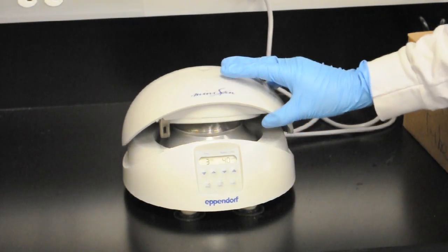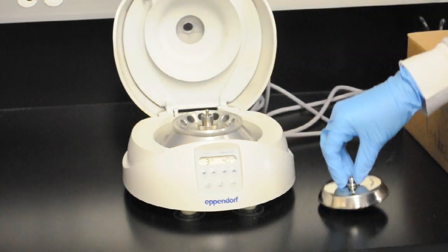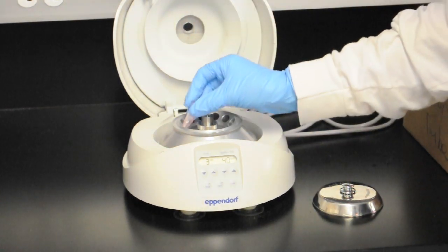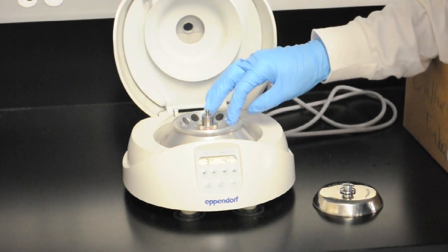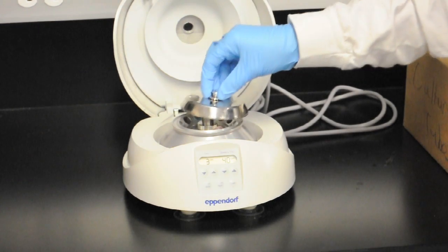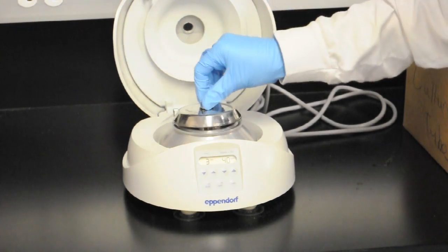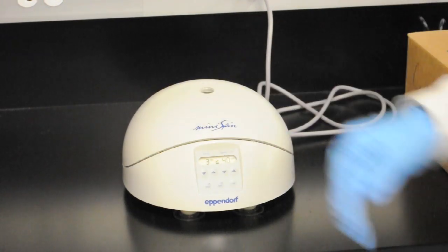It's fairly easy to operate. You punch one button to open it up, raise the lid — there's a small rotor cover — and then our samples go in. We always want to have our samples opposite of each other. There you can see the technician is counting the holes to make sure that they are evenly spaced. We recap it and close the cover.